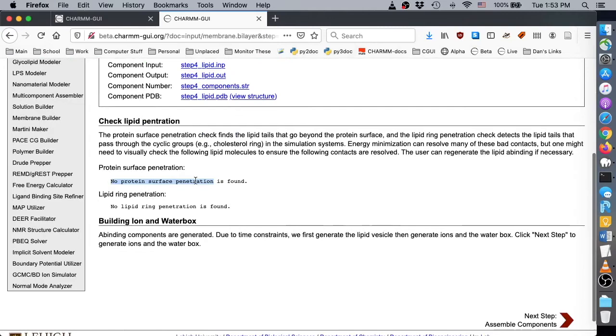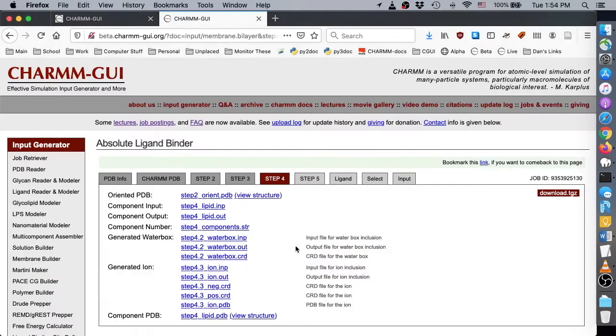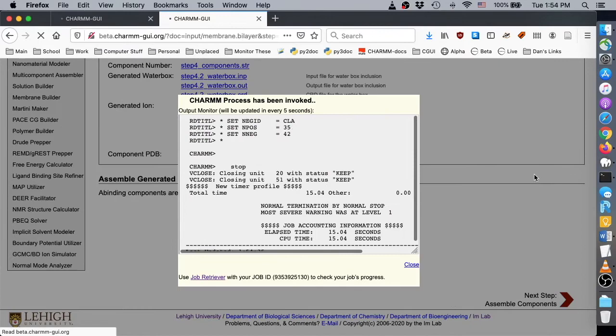On the Membrane Assembly page, click Next to combine the oriented protein structure, water box, ions, and lipids into a single system. When assembly is complete, we can begin the steps for ligand binding.